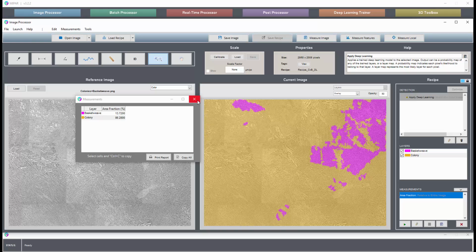So there we have another example of taking a challenging problem with a fairly mundane training process that anyone can do to evolve a really state-of-the-art solution that can take it from there. So let's go back to the slides and then have a look at our training that we started in the beginning.